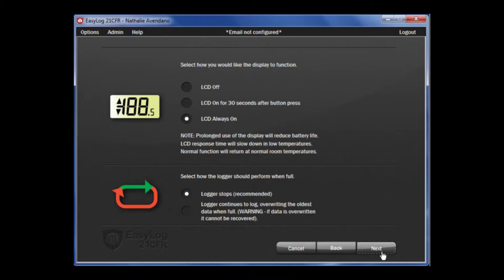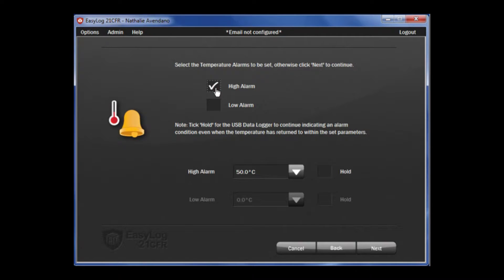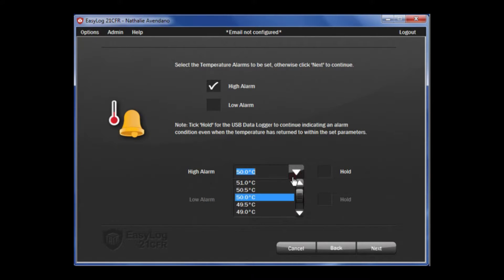Once that is complete, click Next. The next page is Alarm Setup. You are going to set alarms for temperature, so click on the tick box here, which will allow us to get the high temperatures. Using the scroll down button here, choose the appropriate value.